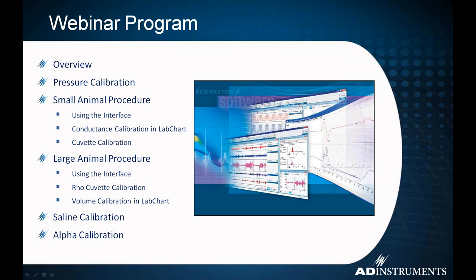Then we'll talk about saline calibration, removing the conductance of the heart wall and actually getting good, accurate volume readings without any influence from the tissue that's surrounding the ventricle. Then we'll also talk about the alpha calibration, the end-all of end-alls, to compare what you're getting with your Millar catheter, Millar and LabChart and the PowerLab, to something like an echocardiogram, to know that we're calibrated and going against a known standard, so we can take care of any variation at all.